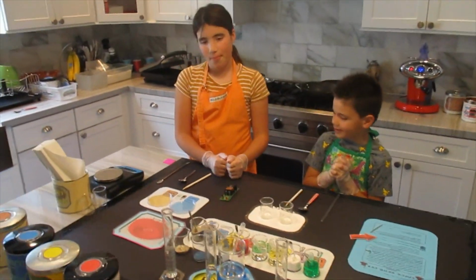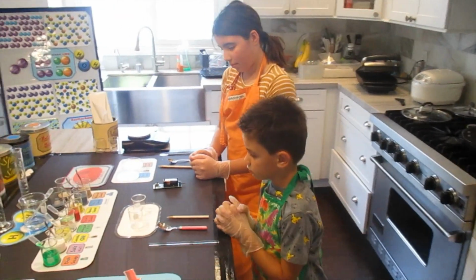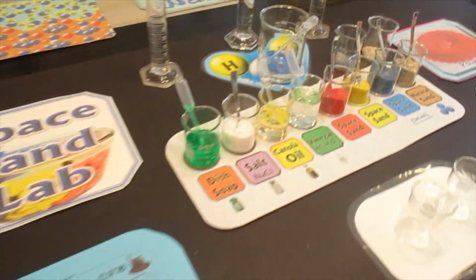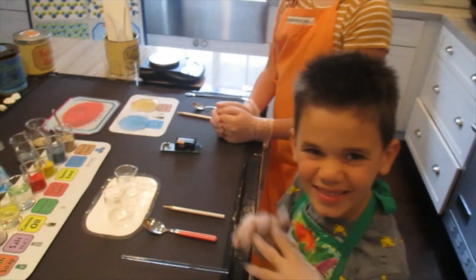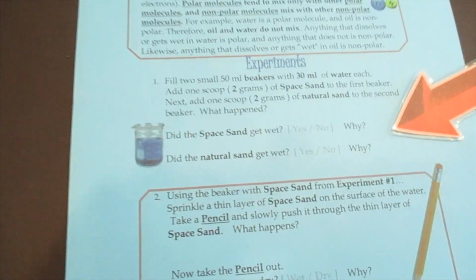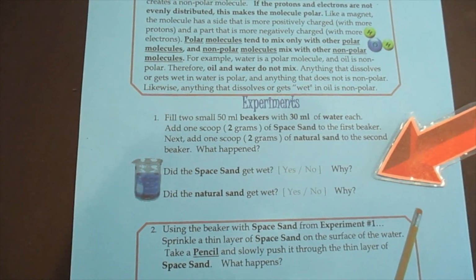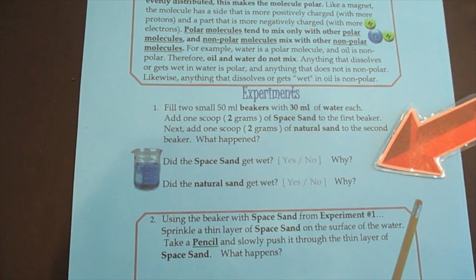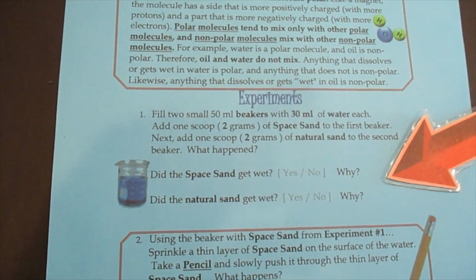Today, we're going to be doing the Space Sand Lab with my little assistants, Ian and Lucy. We're going to do the Space Sand Lab with these materials. And we're going to start with number 1. Number 1 is fill 2 small 50 milliliter beakers with 30 milliliters of water each. Add a little bit of space sand to one, a little bit of natural sand to the other.